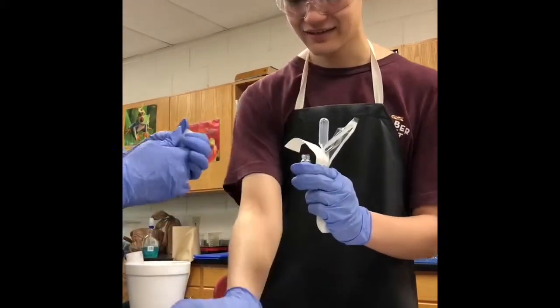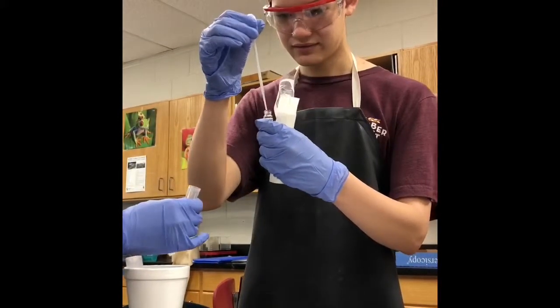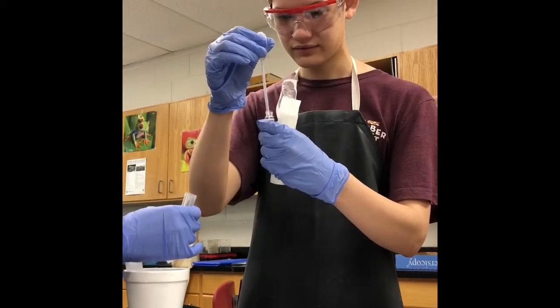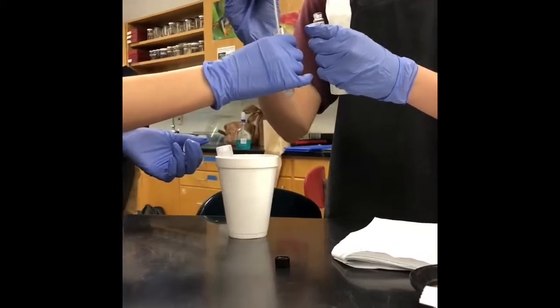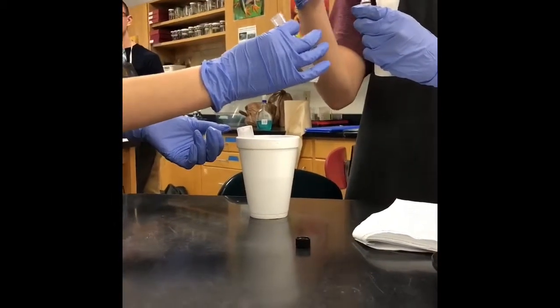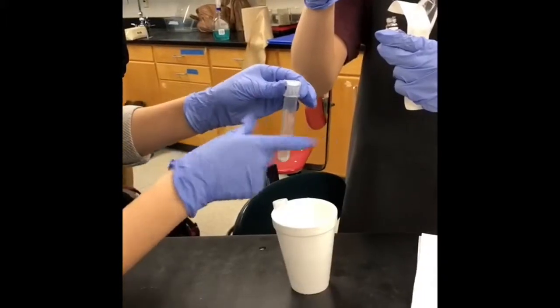Suspend 250 microliters of Luria broth to each tube and keep the tubes at room temperature. Rest.